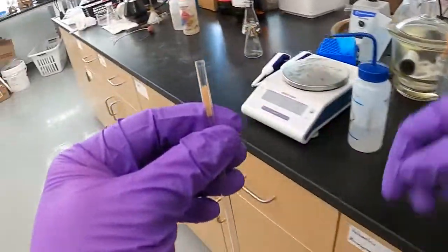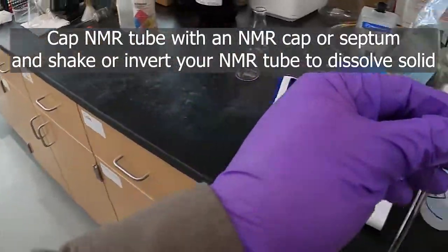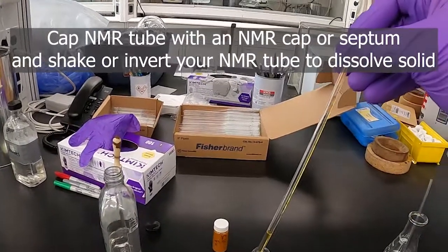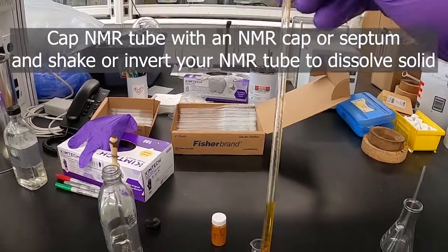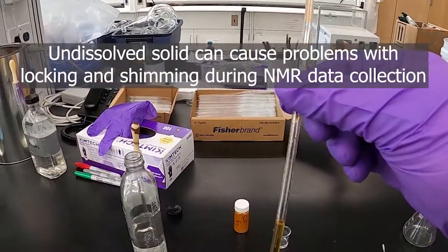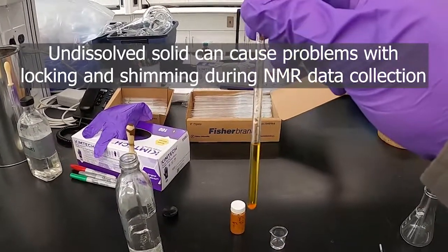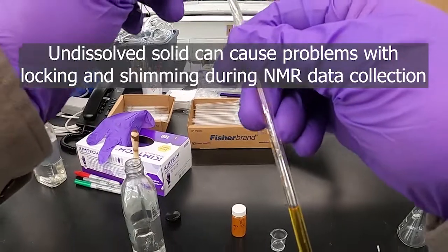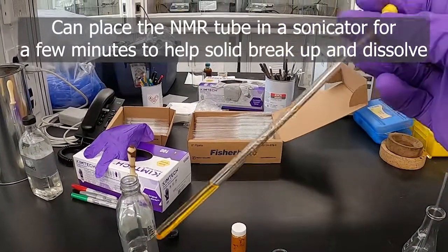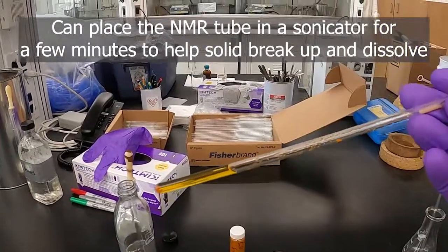Then we can put on a cap. If you can just invert your tube and get your compound to dissolve, that's great. If it doesn't dissolve, you'll want to figure out a way to get that to dissolve, as samples with solid in them won't lock on the solid properly — they'll have issues getting a lock. A sonicator can also help you get a solid that's stubborn to dissolve.